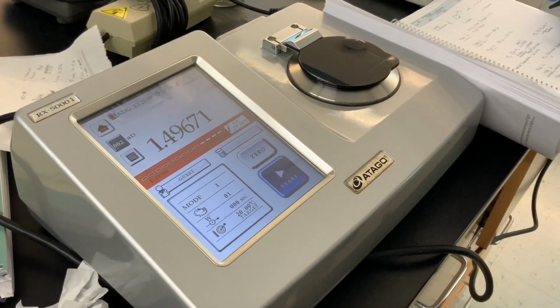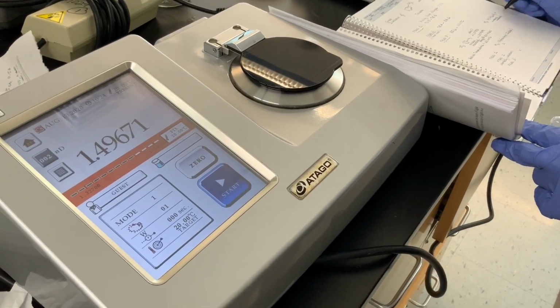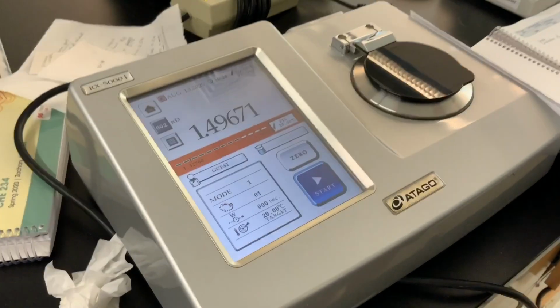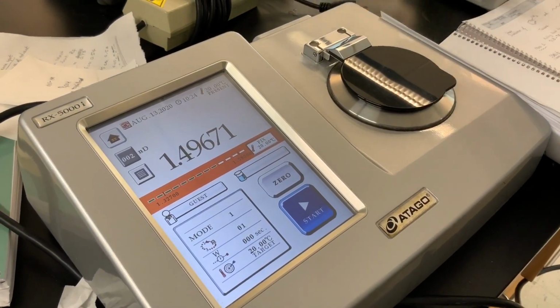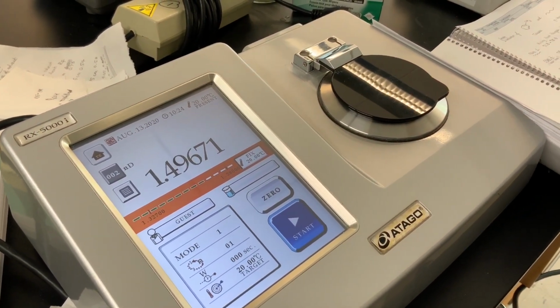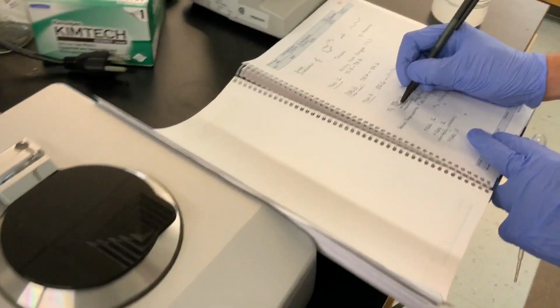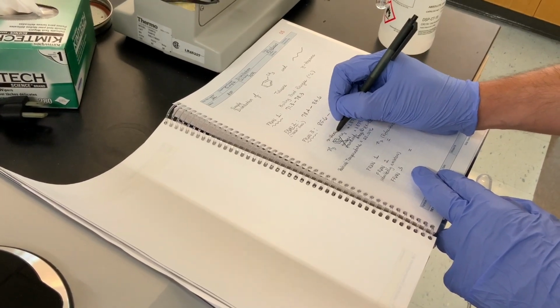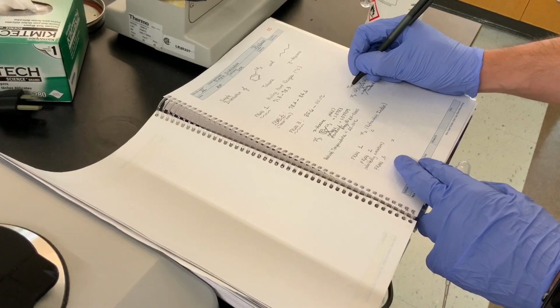And that magic sound gave us 1.49671. And as I'm writing this down, I realized that I put the numbers on the wrong area of the notebook. So if you make a mistake, you just cross it out. So this is actually n-Hexane, and this one over here now is toluene.